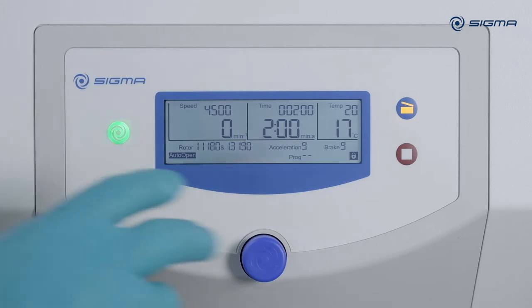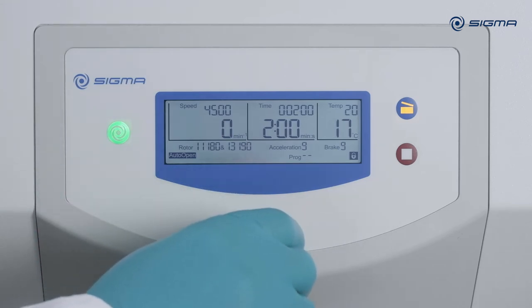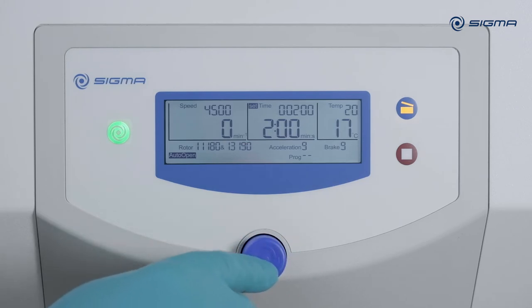To change the runtime, turn the knob four clicks to the right. Press the knob and set the new runtime, then press the knob again to accept the altered value.